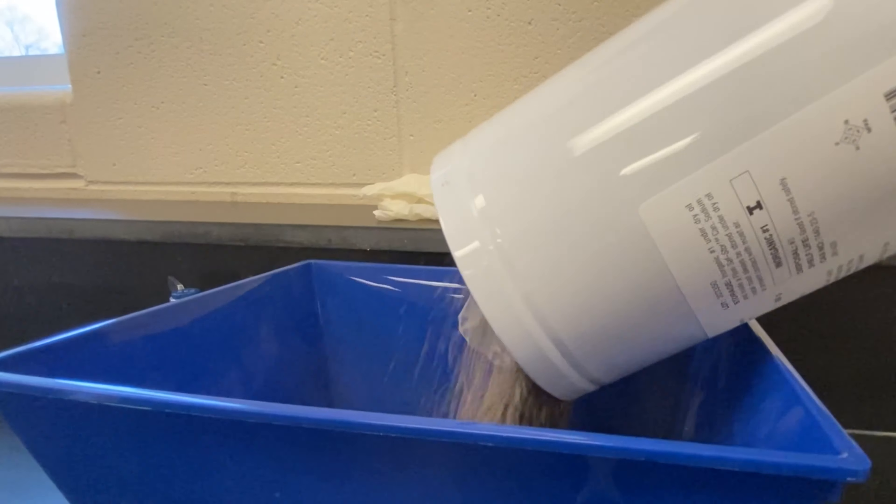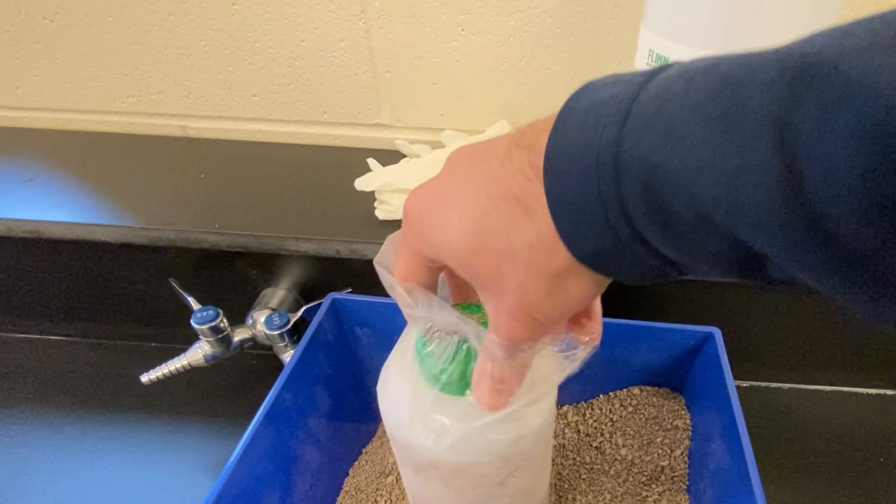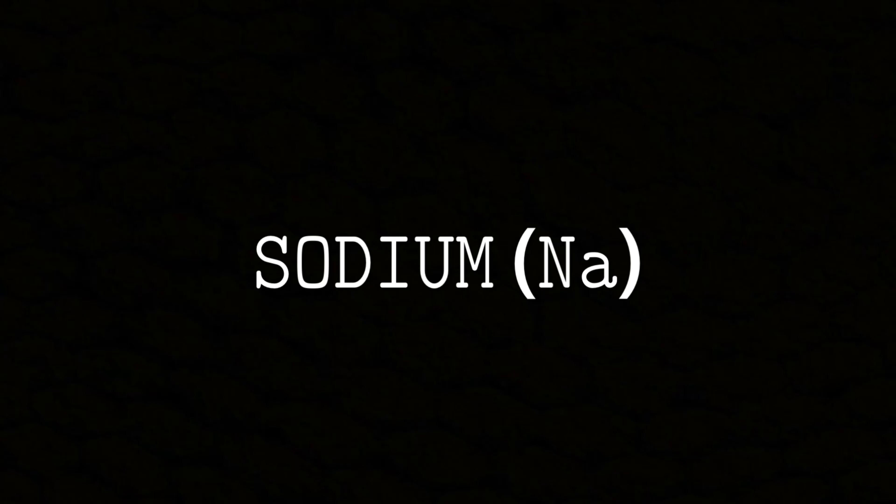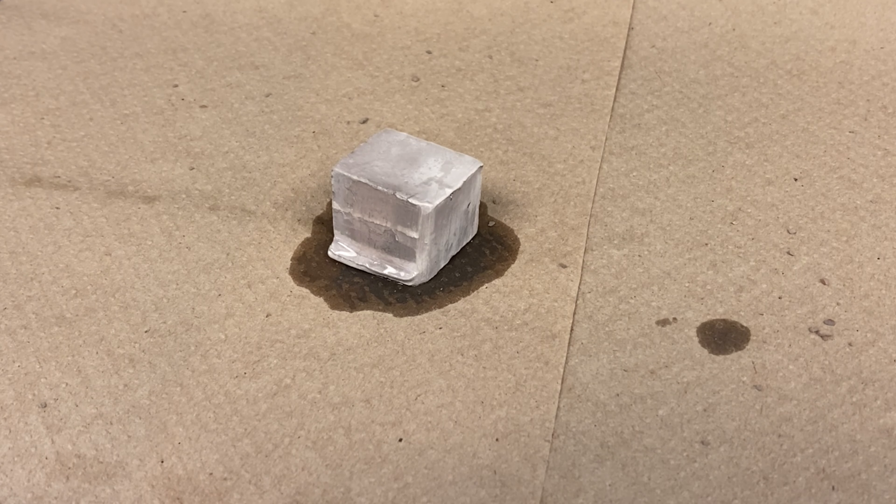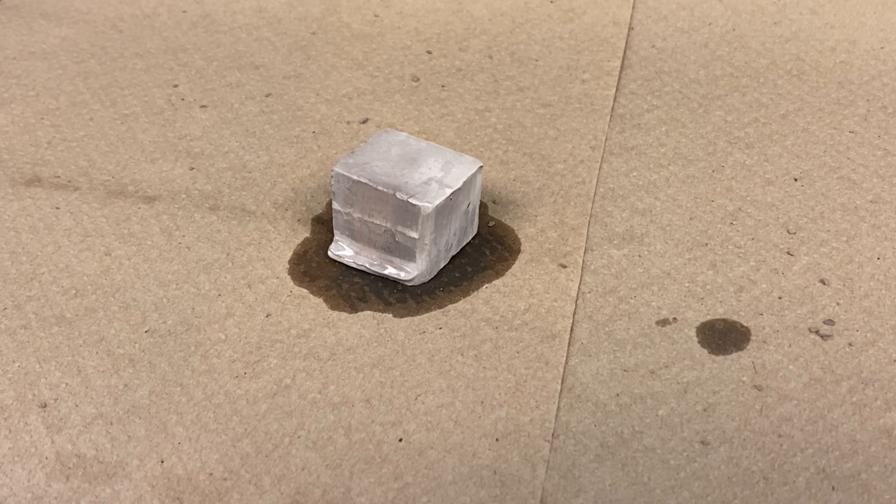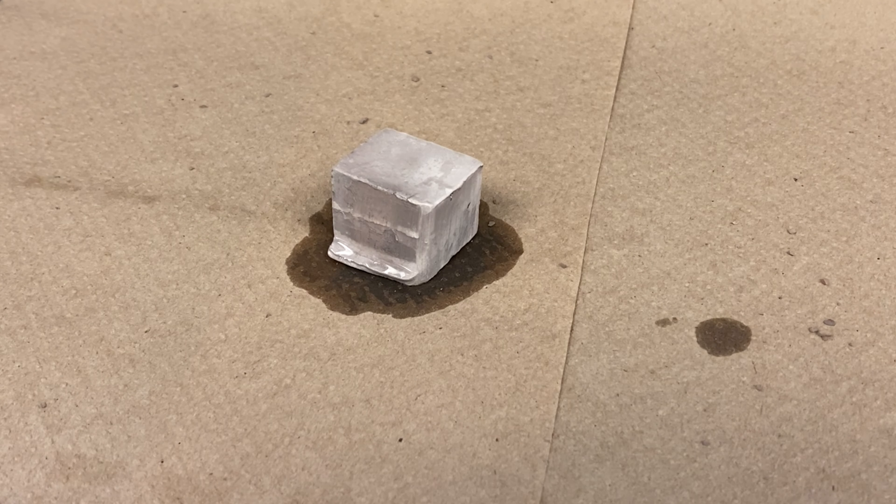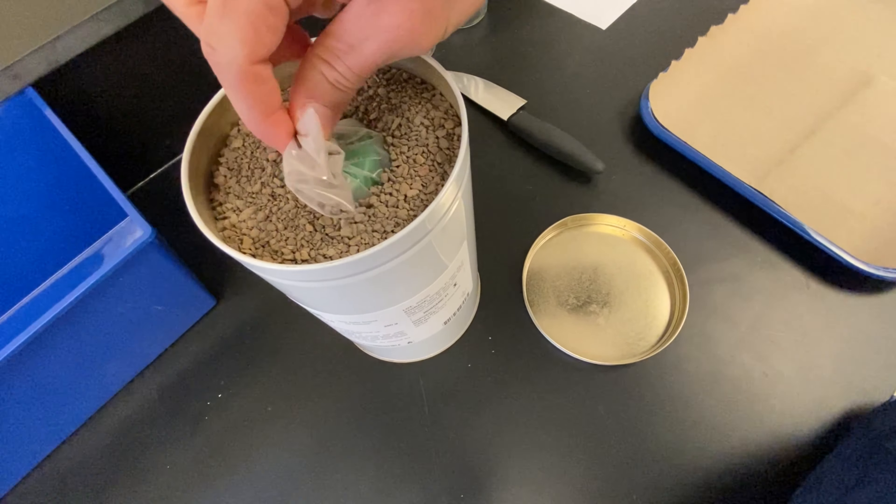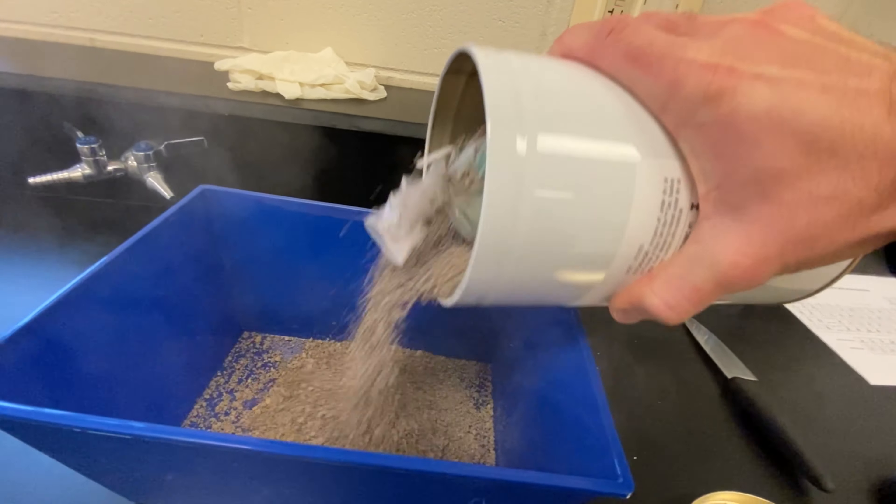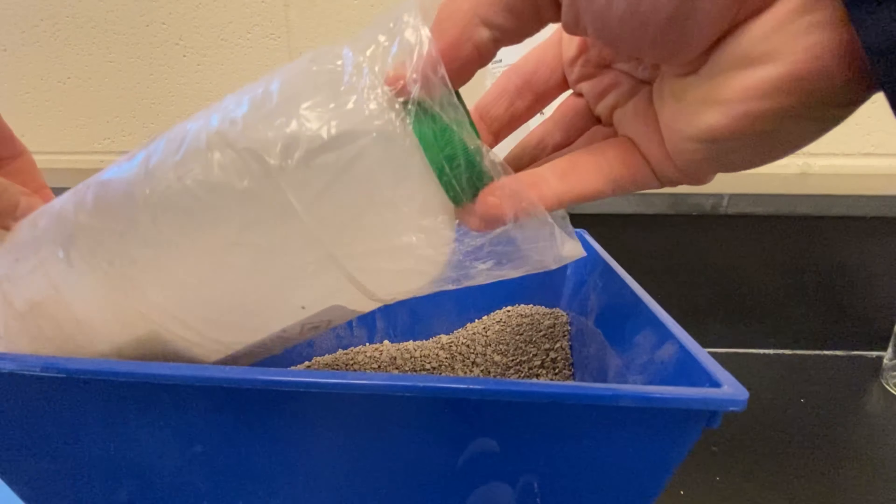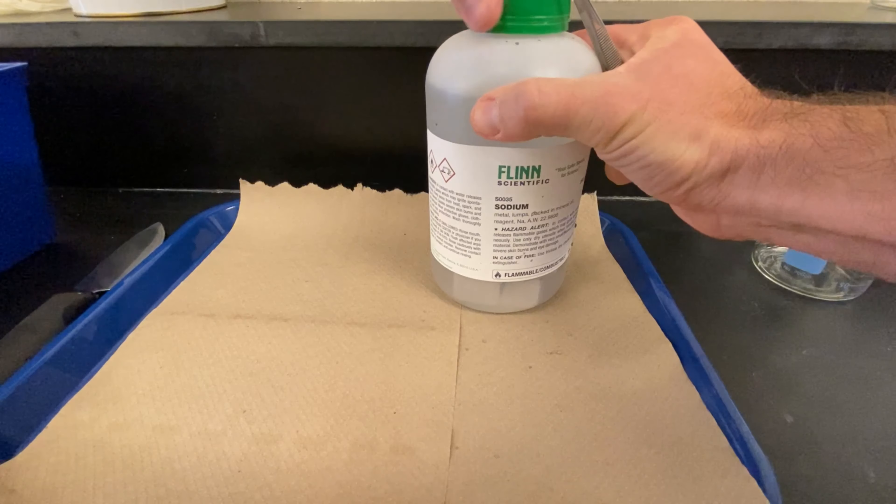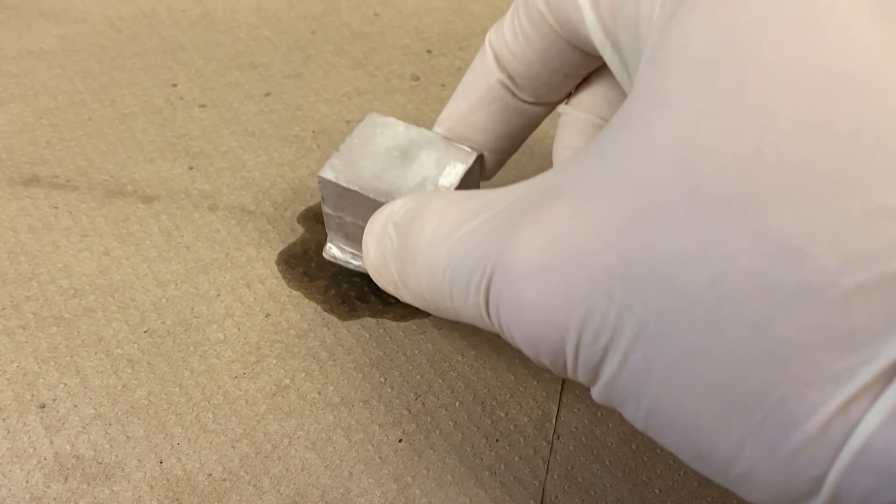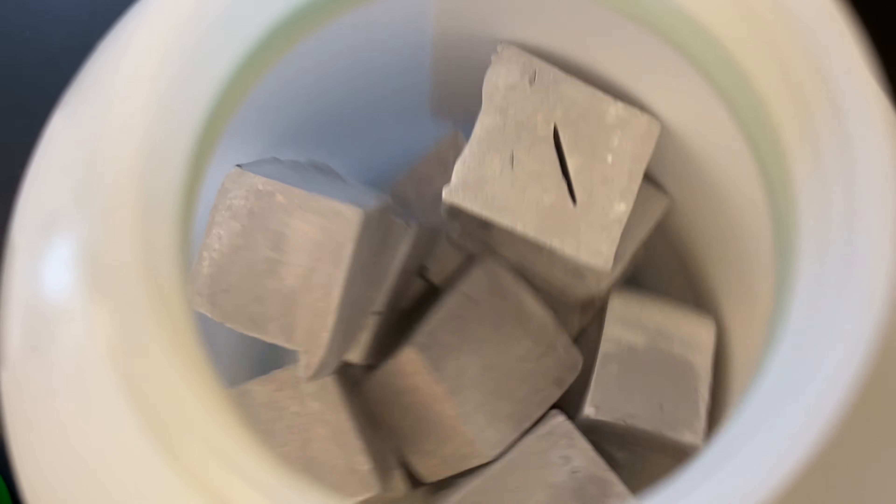I'm going to go ahead and open this for you. Here we go. All right, so this is sodium. And as you just saw, they're not messing around in the way that they ship sodium. They really want to make sure that this stuff doesn't have any contact with the outside environment. You'll notice that I first opened kind of the tin can, and when I opened it, it was filled with kitty litter. That was all those kind of dry rocks that you saw in there. Then I had to unseal it from a plastic bag and slide out a jar filled with a liquid. And when I opened that jar, I removed one of the blocks that was inside there. And this single block right here, this is sodium. This is what it looks like.